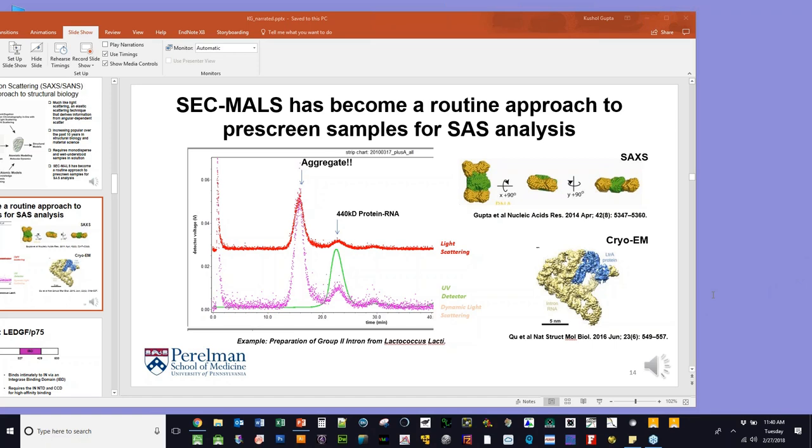And so with specific regards to biological macromolecules, if you're a biochemist, biophysicist, structural biologist, your first reflex is to reach for your GE Healthcare Superdex 200 column, your Superdex 75 column. But an important consideration is that media of that nature tends to shed fines. All right, and those fines in solution as they come off the column can actually increase the noise in your light scattering instrument. So if you do choose those columns, make sure that you are very deliberate in washing those columns extensively overnight before you get to your light scattering experiment.